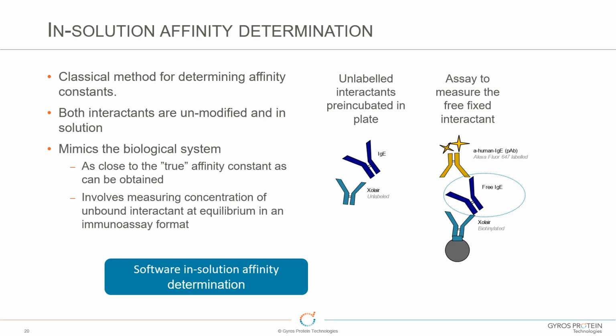I suppose one of the things is that the gold standard for affinity is to use surface plasmon resonance, which obviously requires immobilization of the reagents. So there's always an argument of how representative this is of the biological situation. That's correct, and again, this really gives you a situation where you're measuring your affinity in the environment in which the drug is really interacting in the body.